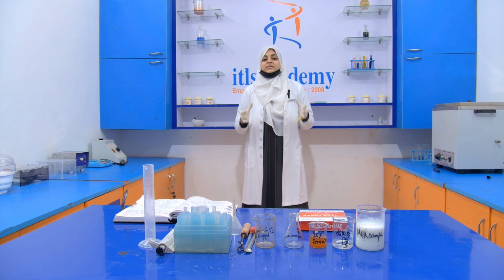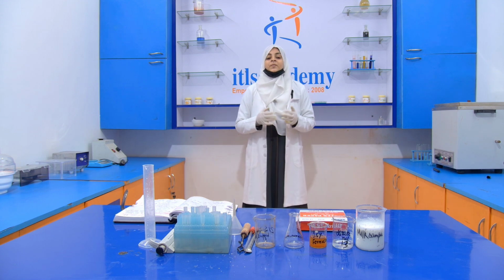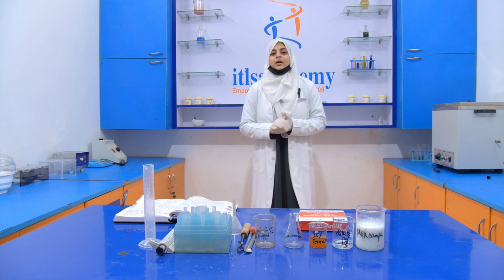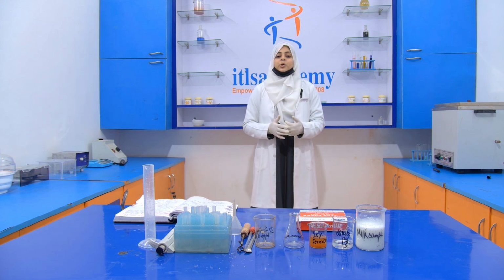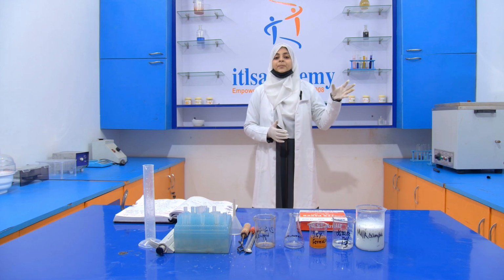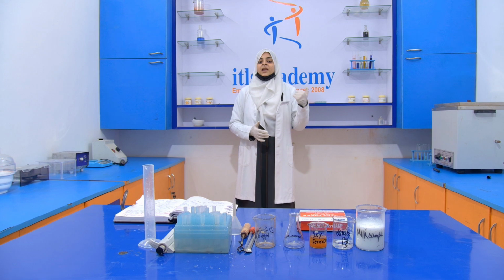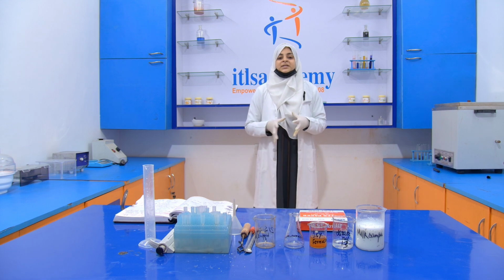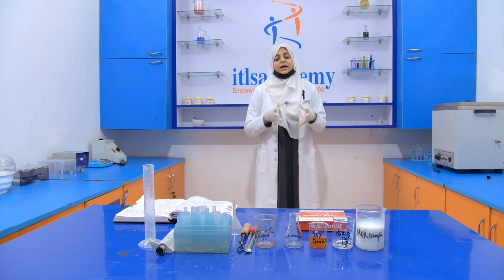Preservatives are simply chemicals which are used to extend the shelf life of food products. But if preservatives are added beyond the limit permitted by the FSSAI, then it will come under the category of adulteration. That's why preservatives are added in a very appropriate amount.